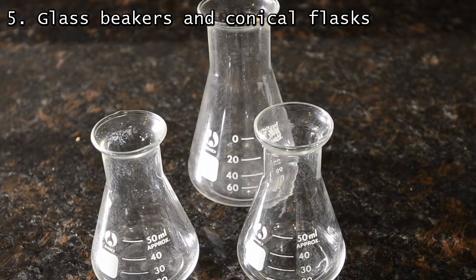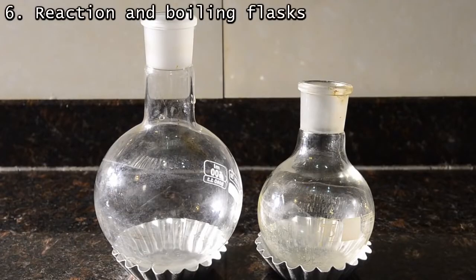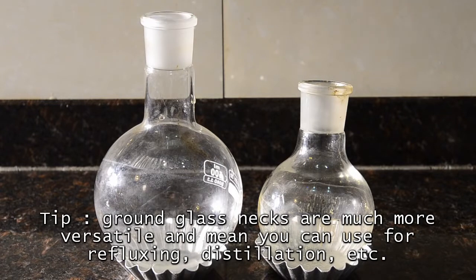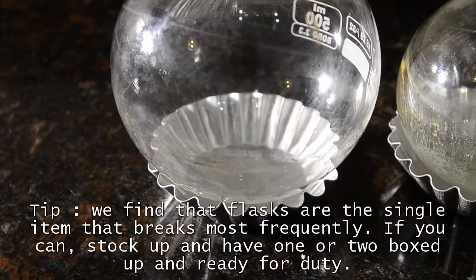But in reality, most of the time you can substitute with a beaker. For flasks, we mainly use 500 ml and 250 ml round-bottomed flasks; occasionally 100 ml flasks are useful. Try to get ground glass ones if you can. We have two of each, but do occasionally break them, so it's worth keeping spares. We use some metal baking dishes as holders, which work great.